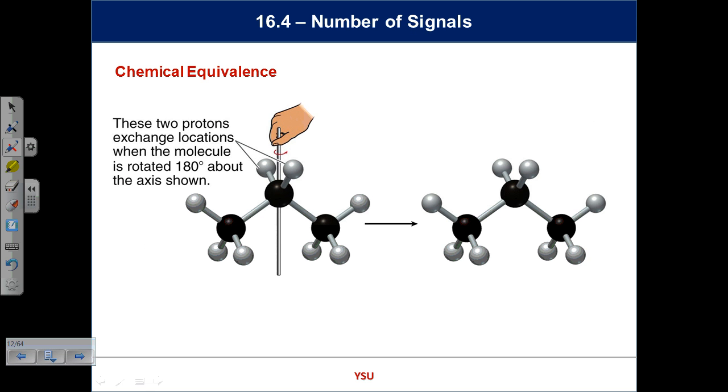We looked at this very briefly last week, where we talked about equivalence, magnetic equivalence or chemical equivalence. Symmetry is important here. If you're okay with the symmetry ideas from the first term, this isn't any more difficult than that. We should recognize now that we have a methyl group at the end, which is the same as that methyl group through symmetry, and they are one type of proton. Whereas this CH2 group in the middle, it's chemically different because it's secondary, and now we're going to say it's magnetically different. It's in a different environment because it's surrounded by different types of atoms.